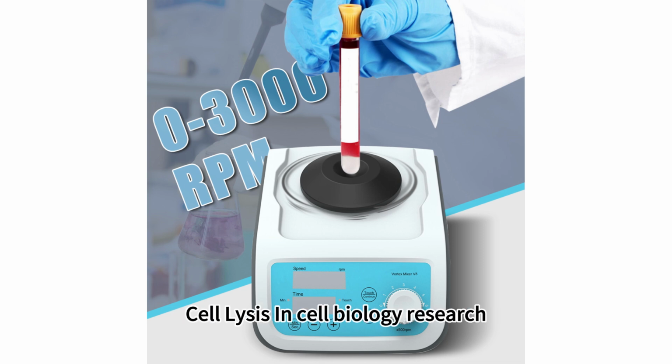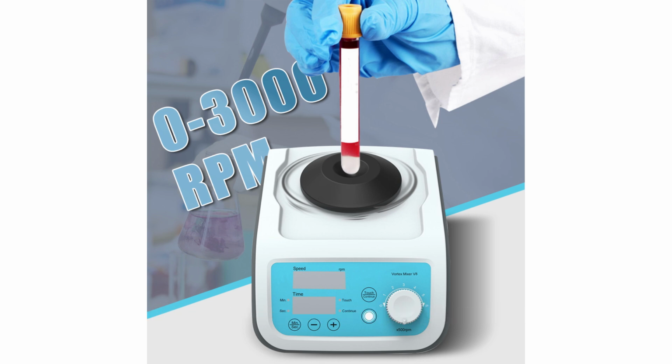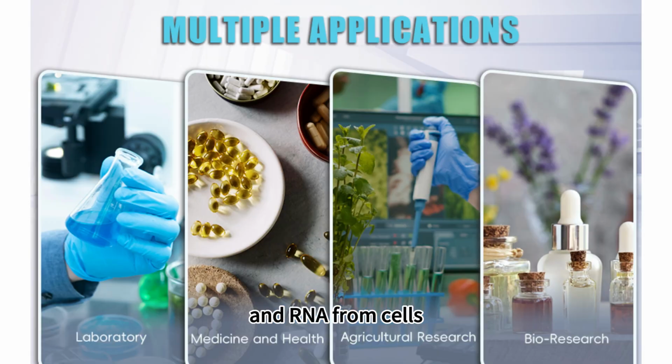Cell lysis. In cell biology research, vortex mixers are used to lyse cells, breaking them open to release their contents. This step is essential for extracting proteins, DNA, and RNA from cells.